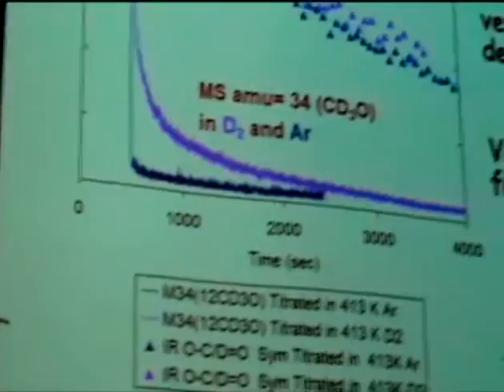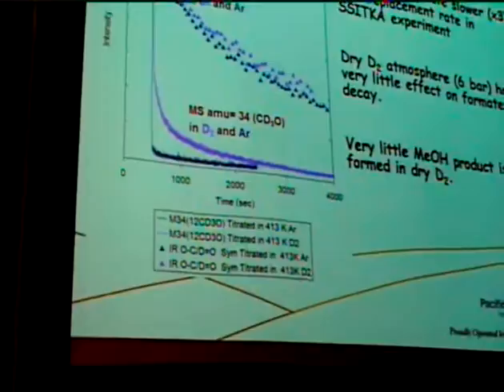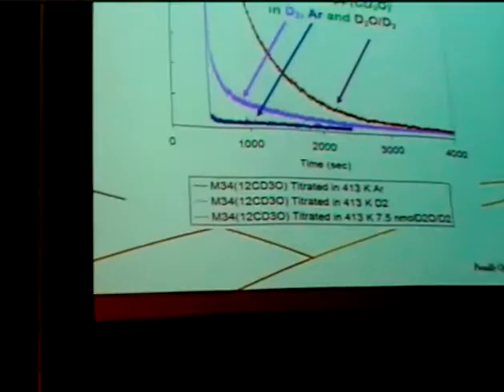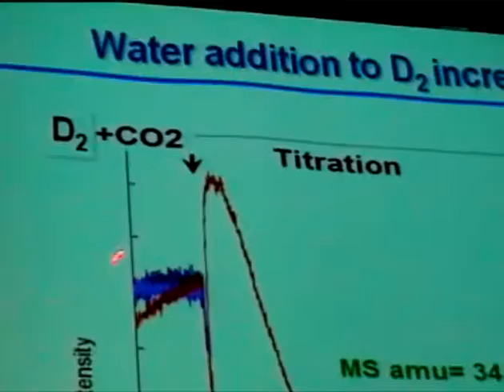Well, water. And the standard stumping question at seminars and conferences like this is, have you ever studied the effect of water on the reaction? Nobody wants to mess with it. But we did. So here's the same experiment, with the mass spec traces. Again, the dark blue is in argon, and the magenta, I guess, is in dry deuterium.